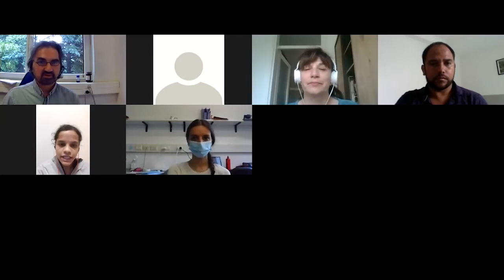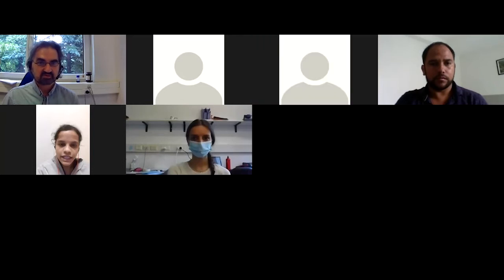So I prepared an introductory PowerPoint presentation first. Let me tell you how this meeting will be scheduled. First we shall describe, probably for the second or third time, some key facts about small angle scattering. Then we will see how the measurements are done, with some video tutorial or video demonstrations.